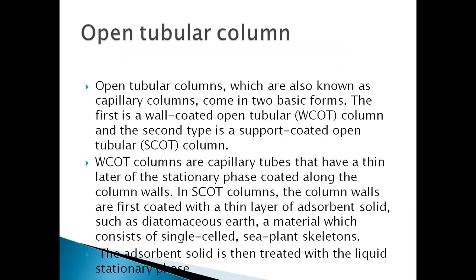Open tubular column, also known as a capillary column, comes in two forms. The first is wall-coated open tubular column, and the second is support-coated open tubular column.